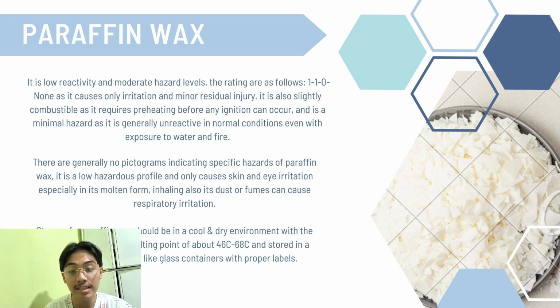For its GHS labels, there are generally no pictograms indicating specific hazards of paraffin wax because it has a low hazard profile and only causes skin and eye irritation, especially in its liquid or molten form. Inhaling its dust or fumes can also cause respiratory irritation.